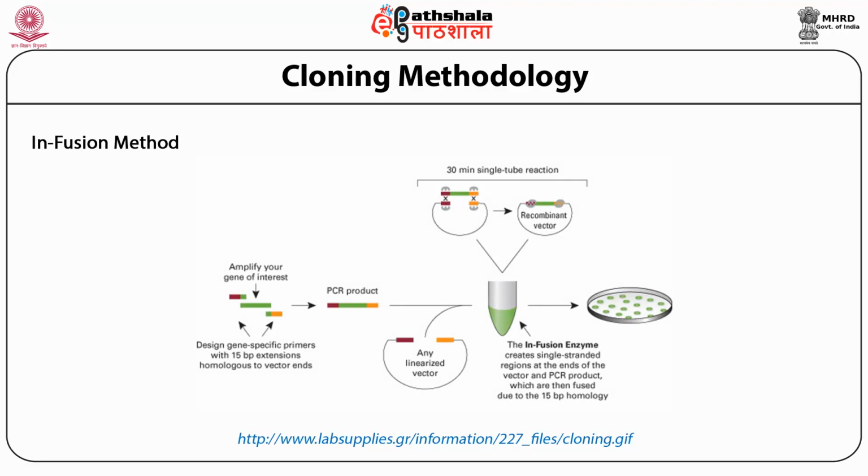Here is the schematic of how the In-Fusion based method is used for cloning our gene of interest into a vector. As you can see here, our gene of interest, shown in green, is amplified by primers which have overhangs. And remember, these overhangs should be the same in the vector where we want to insert our gene of interest. So after PCR is completed, we get a PCR product which has two overhangs, and now this PCR product is incubated with a vector which is linearized and contains very similar overhangs. So these two are incubated.